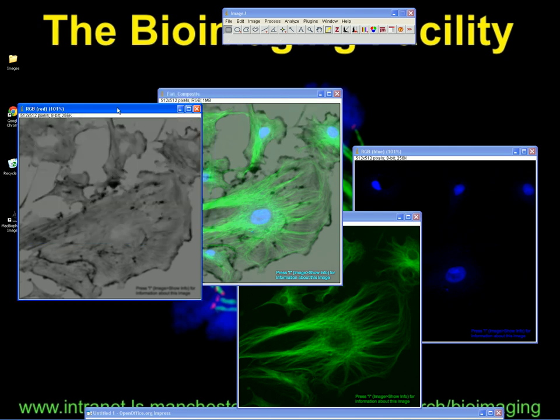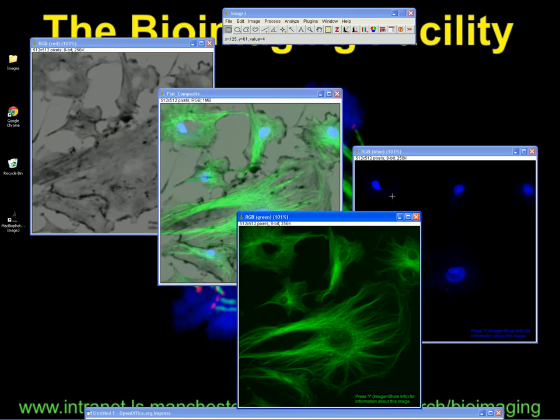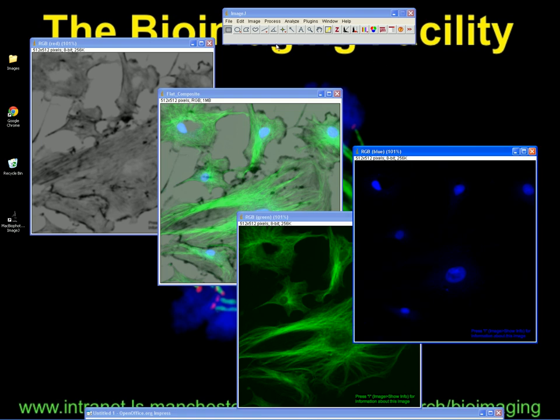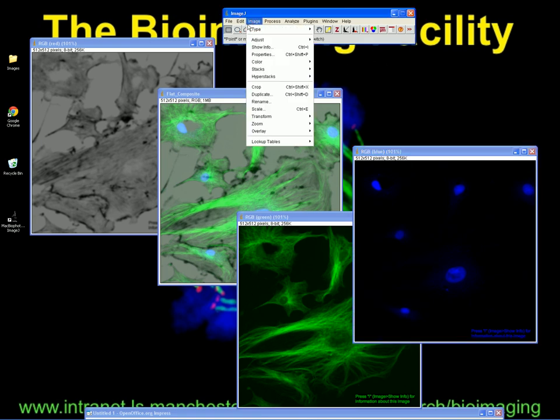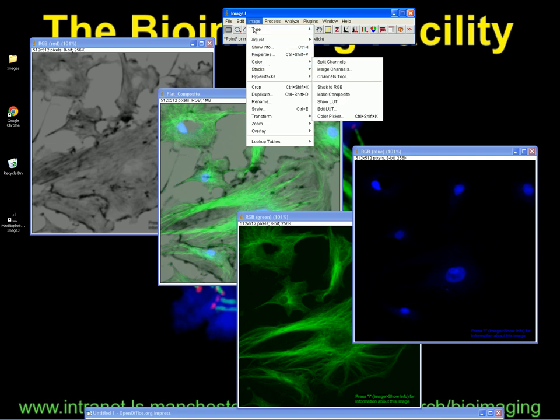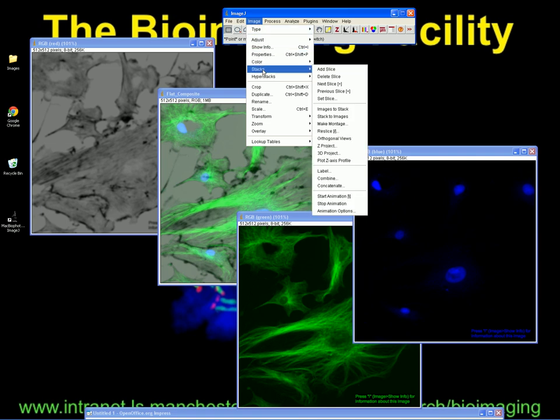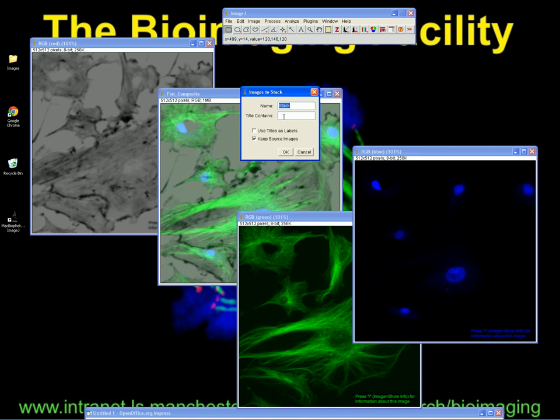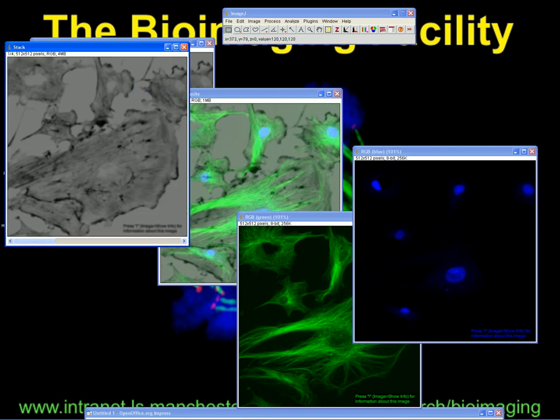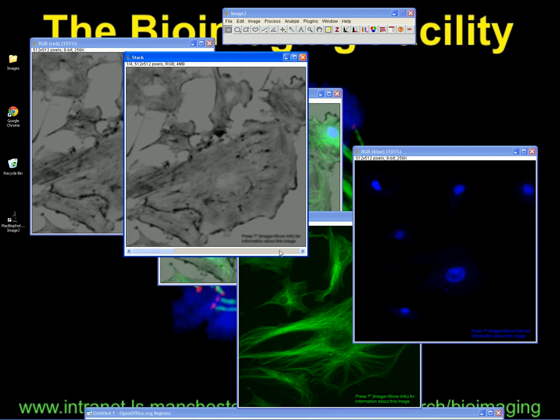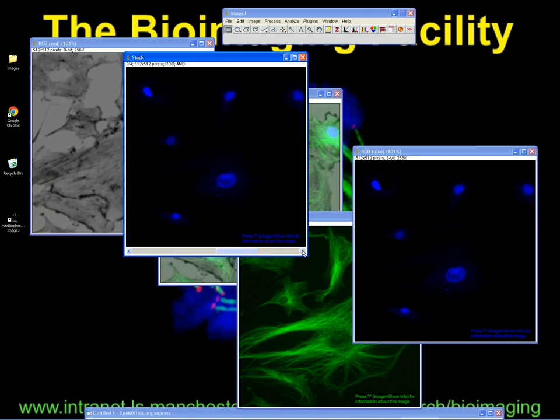You want on your desktop the images that you want to combine together into a montage. What we then need to do is combine those individual images into a stack. The way we do that is go under Image, Stacks, Images to Stack. Make a stack — don't use titles in this case. Keep the source images just in case we've done anything wrong. What we end up with is a stack where we can go through the different colours.